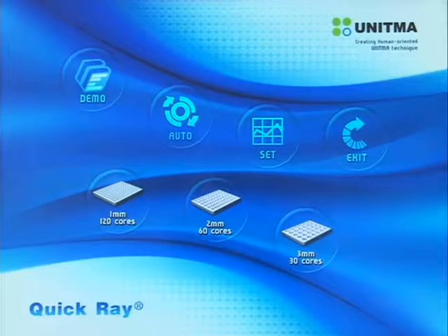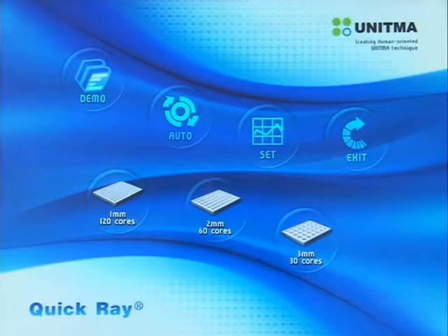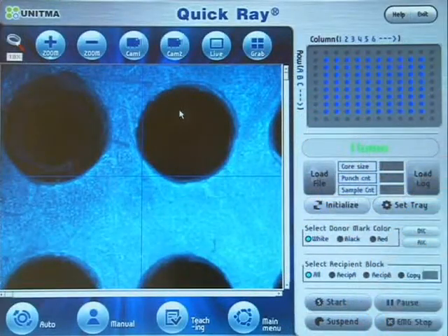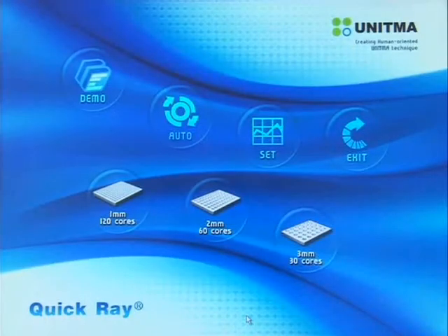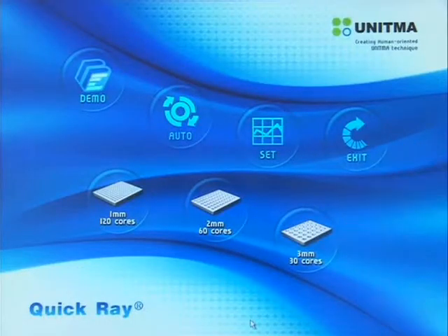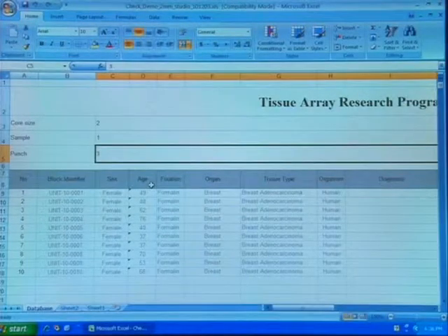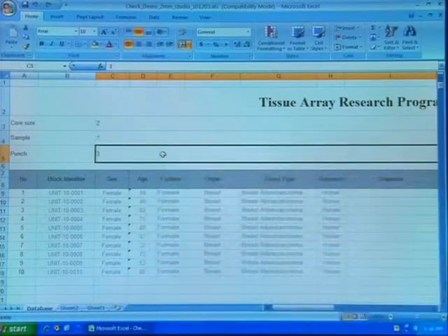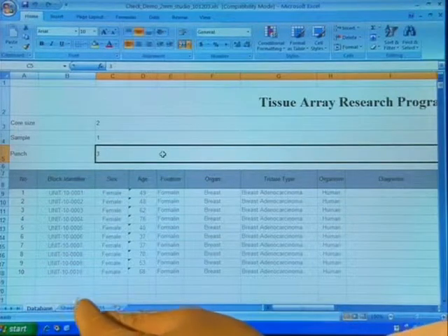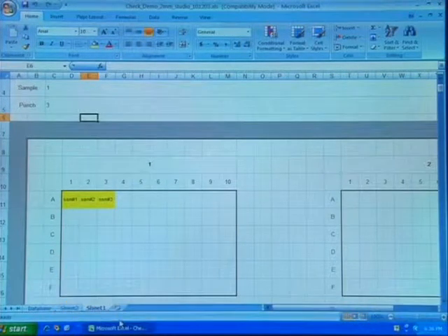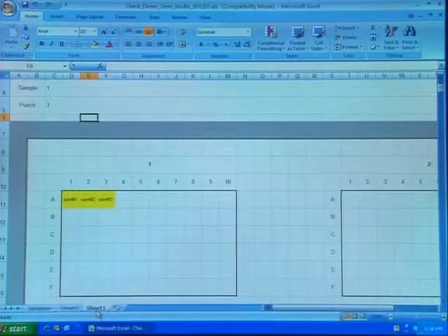The software used in this instrument is divided into four menus: Demo, Auto, Set, and Exit. Demo displays the instrument's auto operation. Auto extracts a tissue sample from the donor block and inserts it into the recipient block according to the TARP program. Set configures the values necessary for operation, such as calibration values. The Tissue Array Report Program, TARP, is in Excel format and has three setting values — the core size, punch count, and sample count — for the operation of this instrument. After a task, this file holds information on the finished recipient block in each hole. The TARP file contains two parts: one for entering information to direct work, and the other for printing or exporting work results.